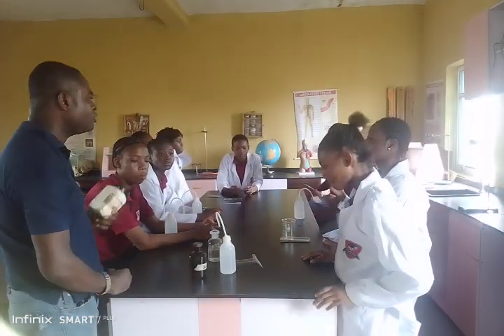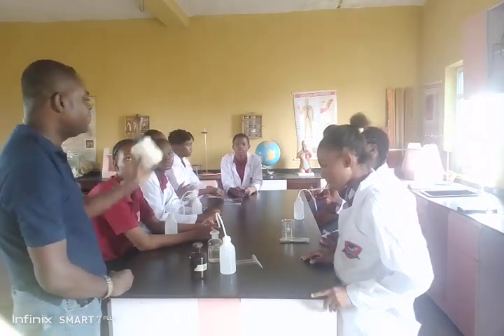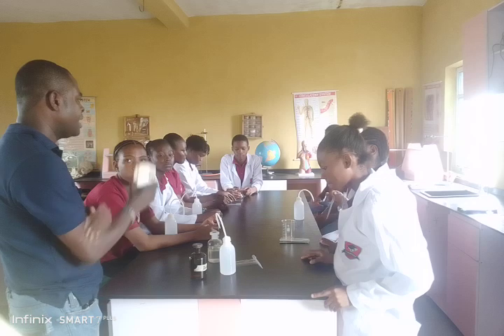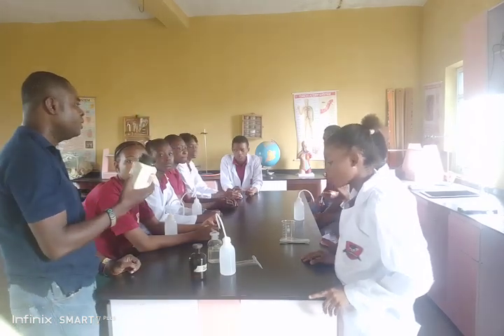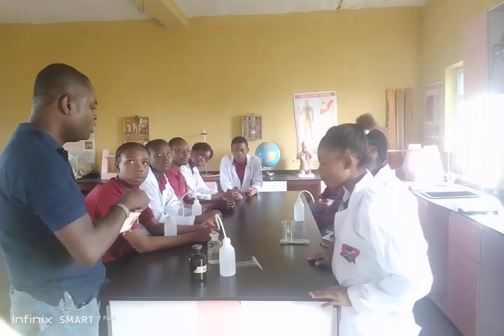So the instruction has been given to you and you have copied. The instruction says C is an inorganic salt, and this is it. It's an inorganic salt. He said you should put C in a test tube, which we are going to do now.